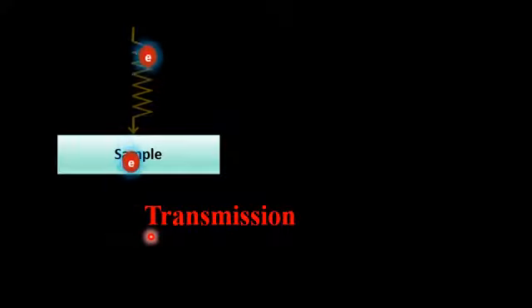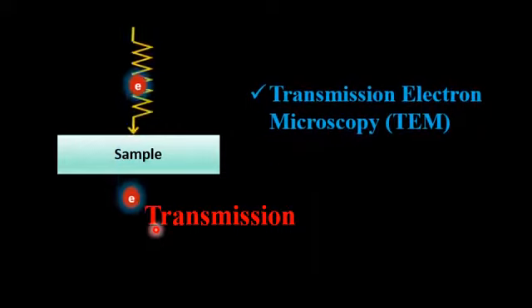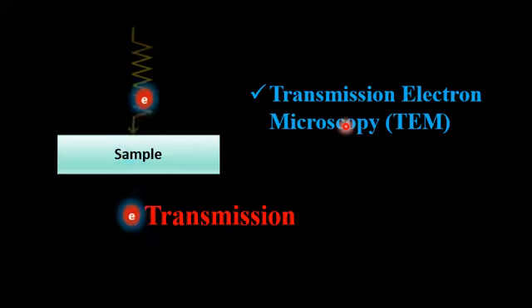One of the most commonly used techniques in the material science and engineering industry is known as transmission electron microscopy. Transmission electron microscopy is a very important technique.